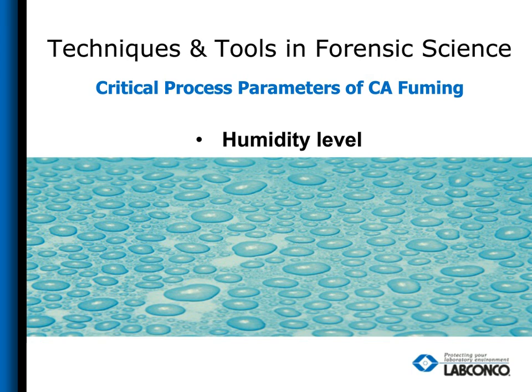A few of the things to keep in mind is age of evidence. If it's been sitting in a very dry, non-humid area for a long period of time, pre-humidifying that evidence might actually increase your success rates on the development of additional latent prints. A lot of the processes out there in the field right now do not have this option, or it's an option you have to always include with fuming.